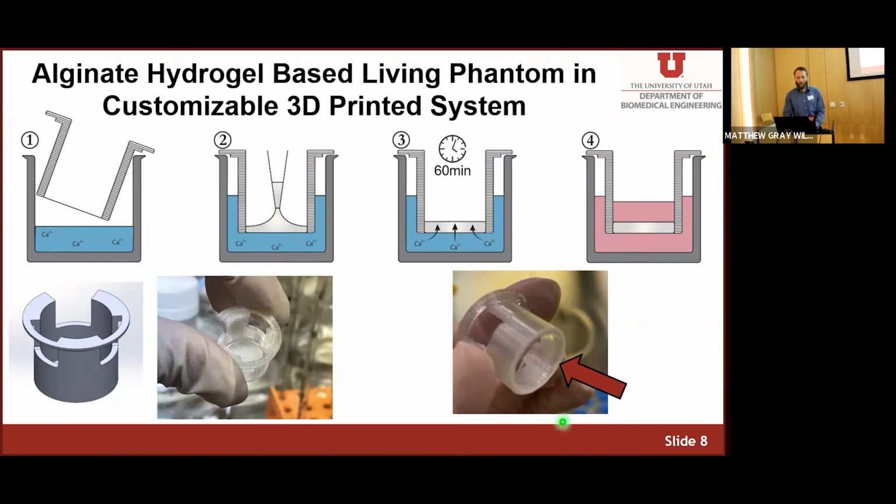And it's also worth noting that we've been able to make this hydrogel completely transparent. The hydrogel is actually in there in this insert. I've just removed the cellulose membrane there, which is going to be important when we start visualizing cells.